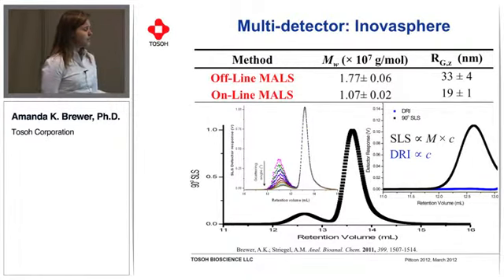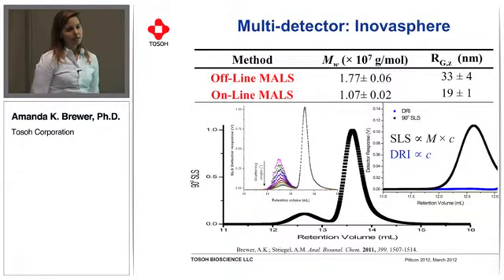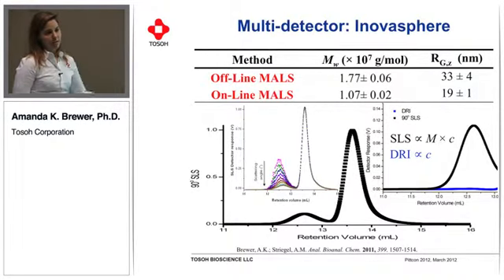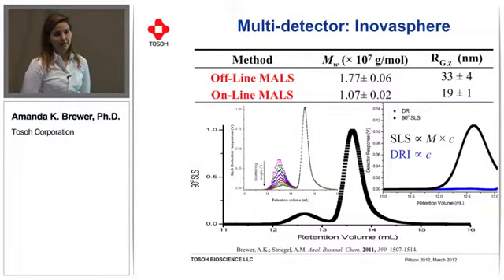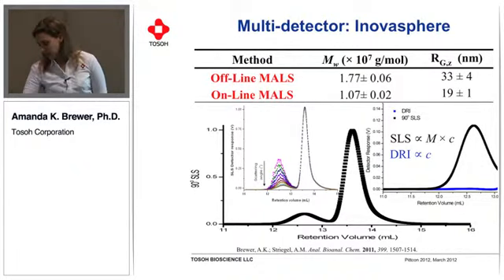But the point is that when I was showing you the TEM, we couldn't see this. We had no idea this was present because it was at such low concentrations. So when we move from a TEM type measurement to a size exclusion or chromatography measurement, we can actually obtain more information about this sample. This is also helpful for the company, in that they need to be able to get rid of this or identify this if it ever wants to be used for drug delivery or something like that. They have to be able to identify every portion of what's present in their analyte.